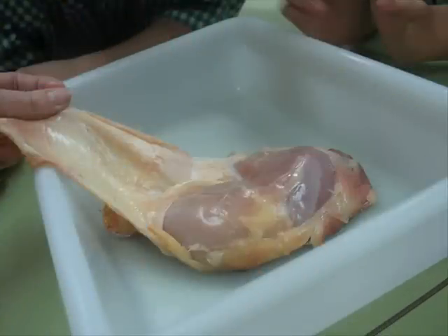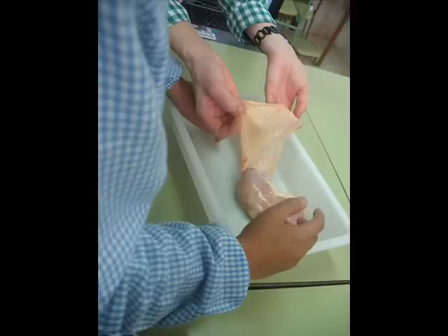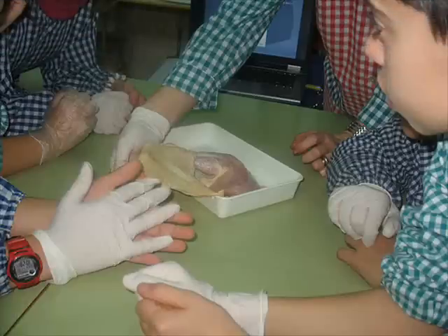While you peel it, you also smell it. Check the stretch of the skin. Study the inside part and the outside part of the skin.